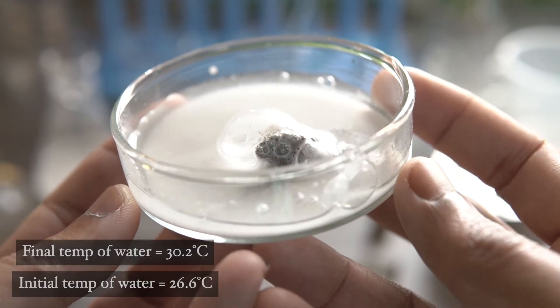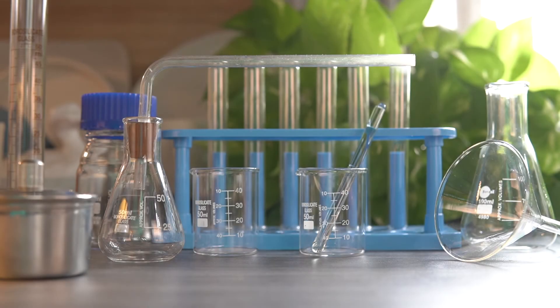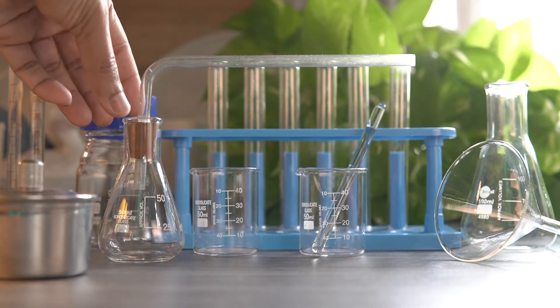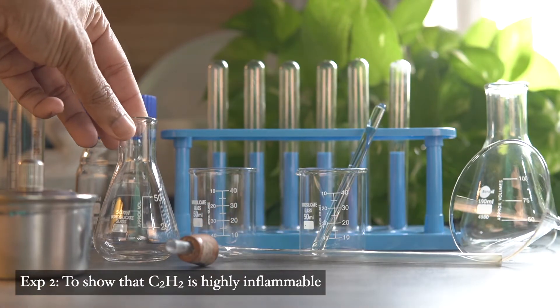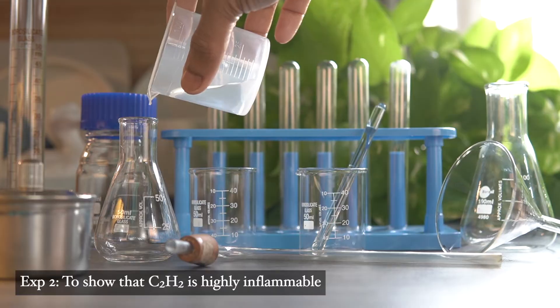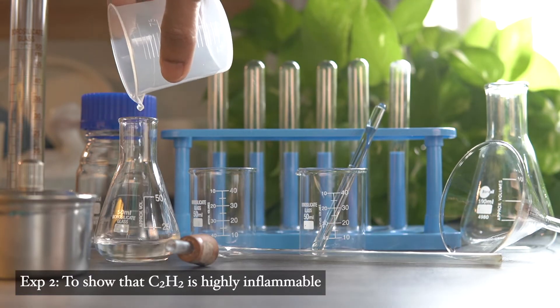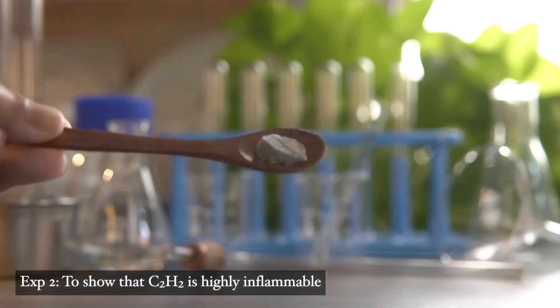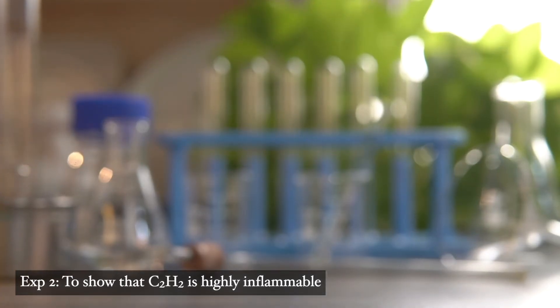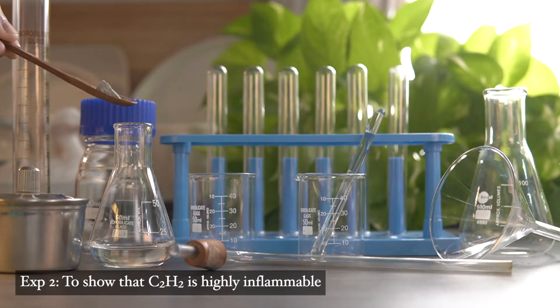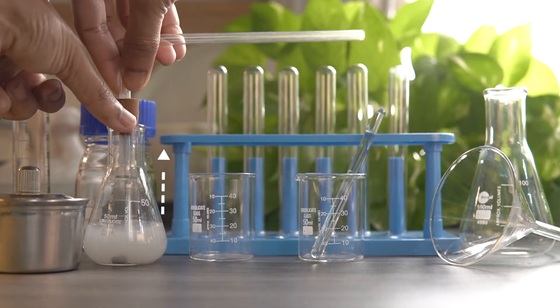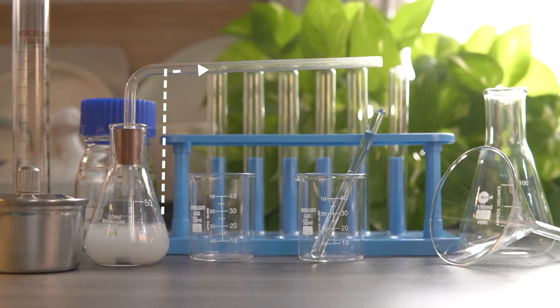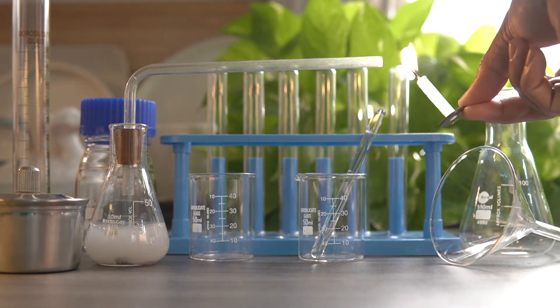To study the nature of the gas formed, we will take a conical flask fitted with a delivery tube. We will take some amount of water inside the conical flask. Now we will add a small piece of calcium carbide into the water and immediately close the open mouth of the conical flask with a delivery tube. We'll place a lighted candle at the open end of the delivery tube and immediately the gas catches fire.